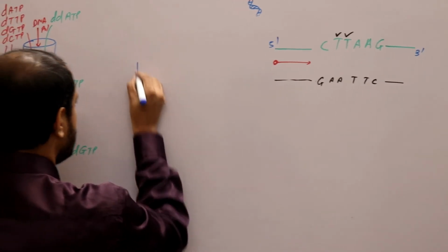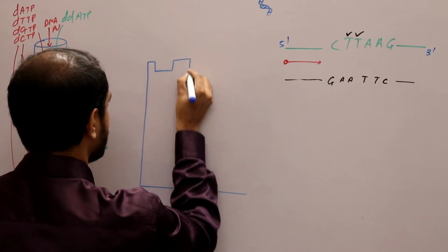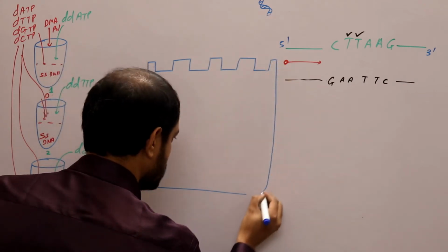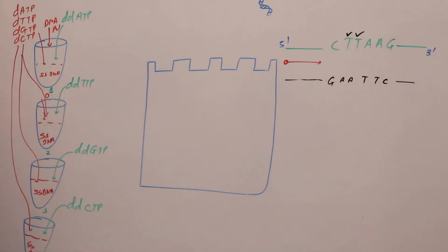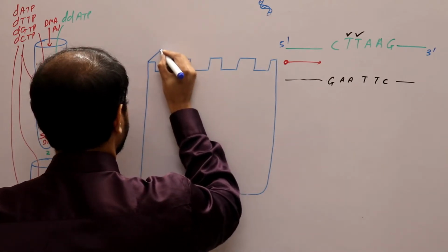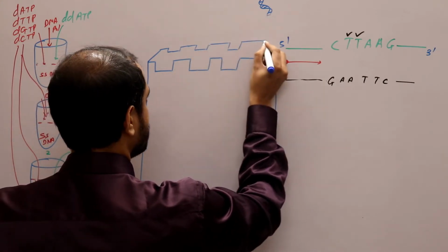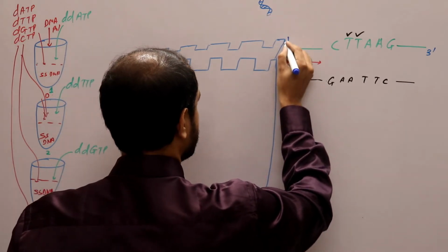Now we will have to add all these mixtures in an acrylamide gel.